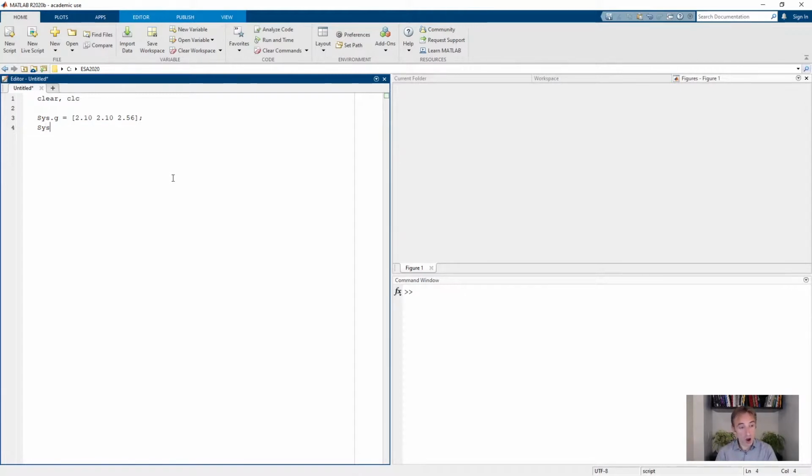Let's add some broadening, convolutional Gaussian broadening with LWPP. Let's say 1 millitesla for simplicity. This is exactly the same as we did for the liquid state simulations. All the sample definitions work exactly the same. For the experiment, the minimum required is the microwave frequency. Let's stay again at X band, 9.5 gigahertz.